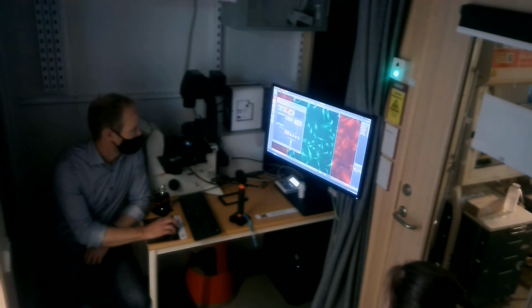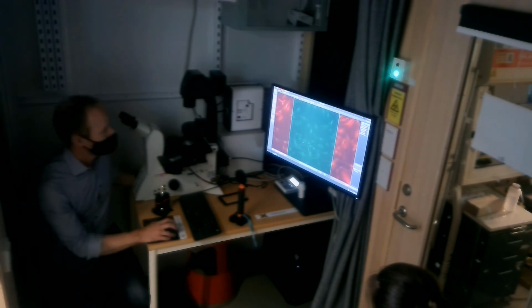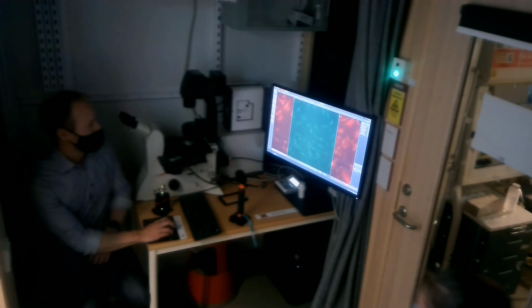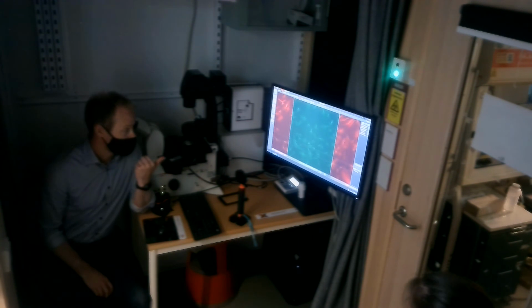I can probably go even lower. So even here, with very little light, I can probably still get the correct focus. So if I have something that is very sensitive and I do it manually, I can find the focus. Also, the computer would be able to find this focus much easier.